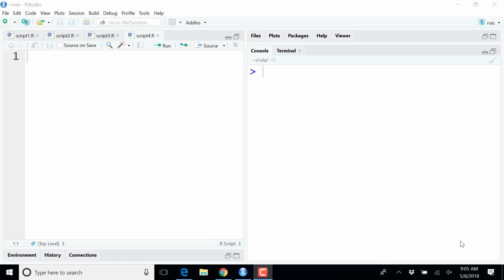Start doing this with pen and paper, and then you can ask yourself, does this figure display the information that I want to communicate? It's very easy to get caught up in code and confused by the syntax of a package, especially if it's a new package, and we try here, we try there, and then we get involved in the syntax of the code, and we forget the message we want to communicate.